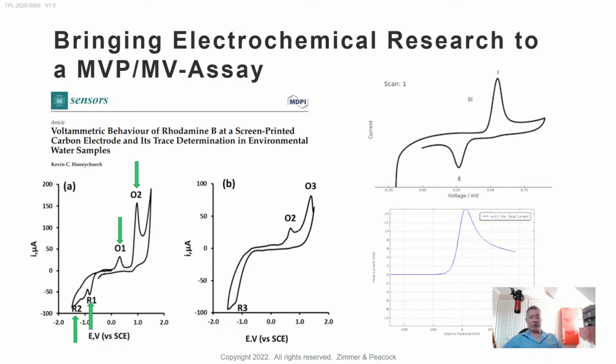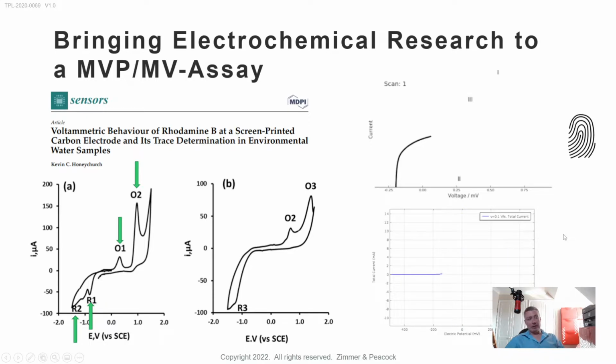It just illustrates a point, which is that in some applications, the molecule that you're trying to analyze could be a molecule using tracing, or it could be a molecule that's part of food quality. Whichever, these molecules can sometimes be in quite high concentration. That does actually help this kind of work. But that voltammetry that we're looking at here is, rather than a voltammetry, you can consider it really a fingerprint. So we have a fingerprint for one of the molecules, and it was easy to argue in this example that that's very different from the voltammetry of the other molecule.